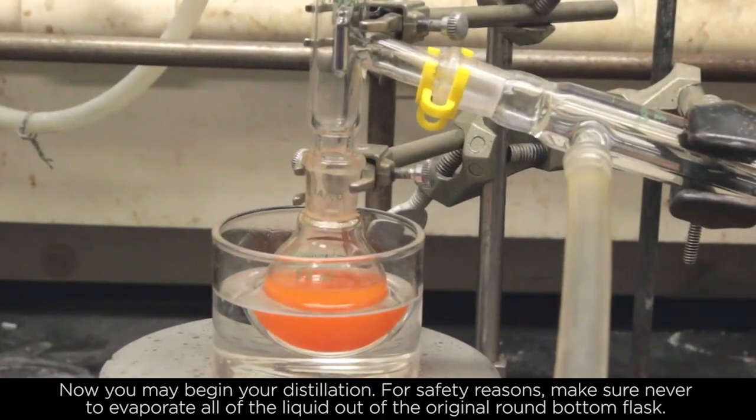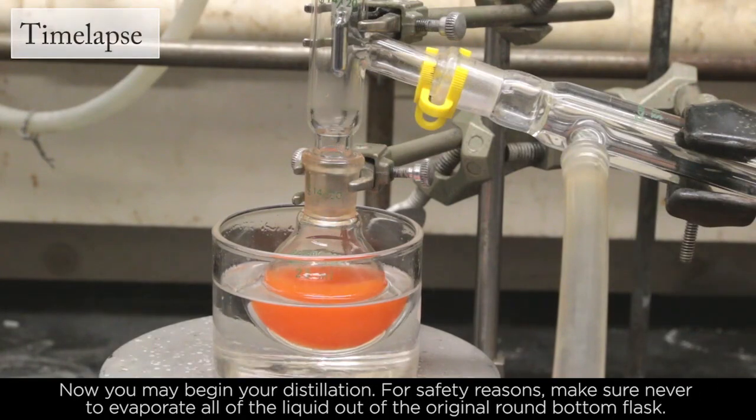Now you may begin your distillation. For safety reasons, make sure to never evaporate all the liquid out of the original round bottom flask.